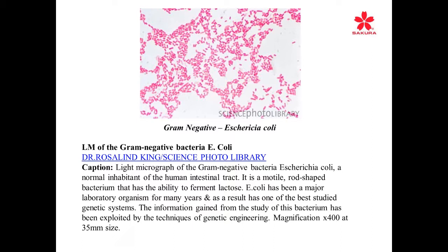And the first stain is typically crystal violet, the blue, and the second stain would be a counterstain, such as safranin. And here you see the safranin staining, but you do not see the crystal violet still staining here.